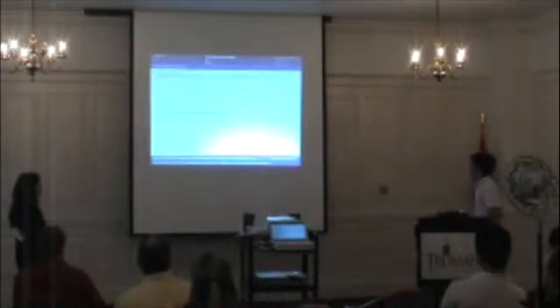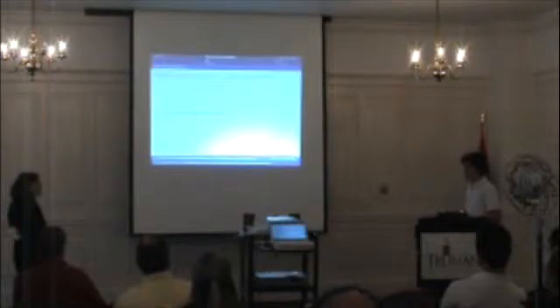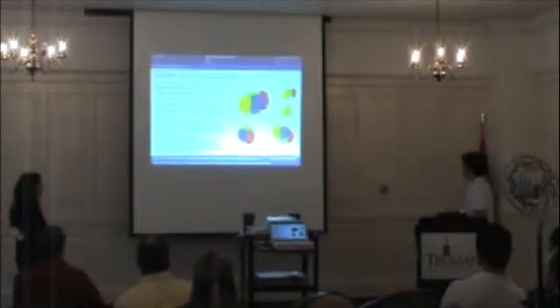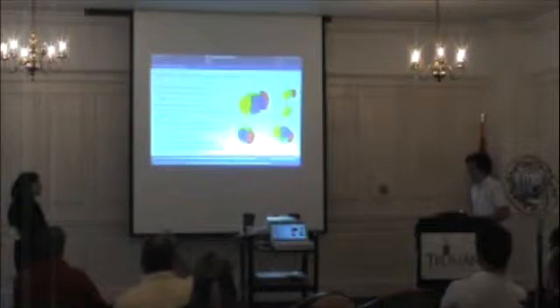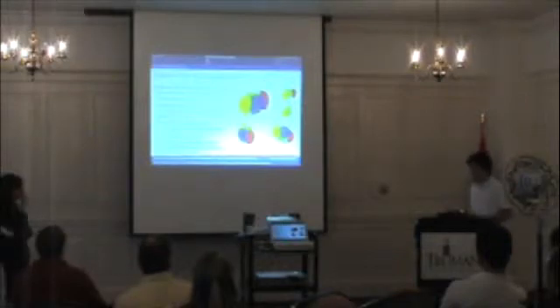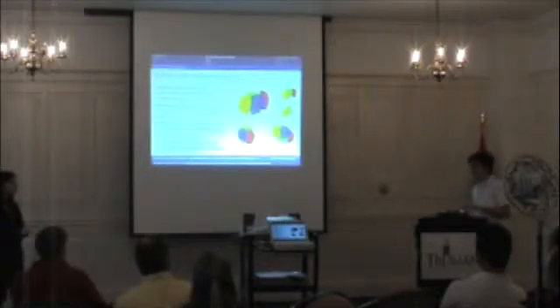So, up to this point, we've had a summer's work. Last summer, Clayton Davis and Elise Wall put a lot of work into this project, and they accomplished some great things. Last summer, they managed to manually segment a 4-dimensional microscopic data set, and this is just one bullet point, but it's not a small feat at all, as Alex can talk about later. But 4-dimensional microscopy essentially gives you dimensions of length and width in different focal stacks, which act as depth, and then over a period of time.